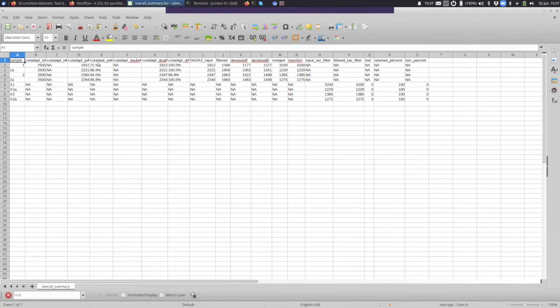Primers were found in about 72 to 94% of the reads. This is an important feature also: by default, only sequences that contain the primers are kept. The primer is deleted, but sequences that do not have a recognizable primer will be thrown away. And then we remove this second primer as well. We lost very few here, actually, only 3 sequences.